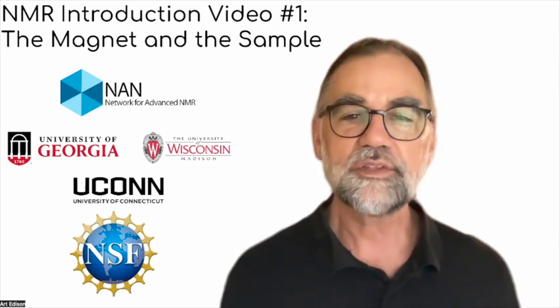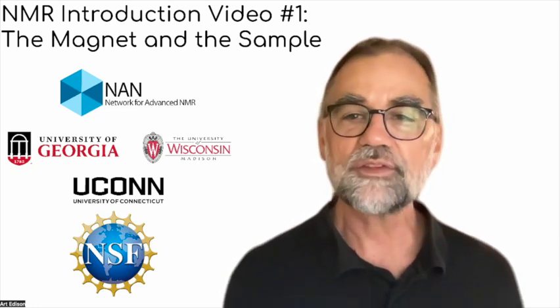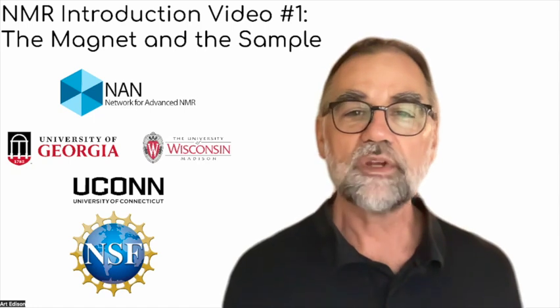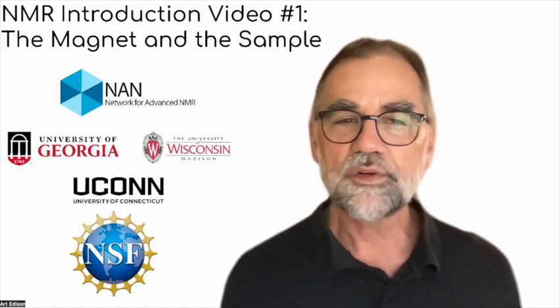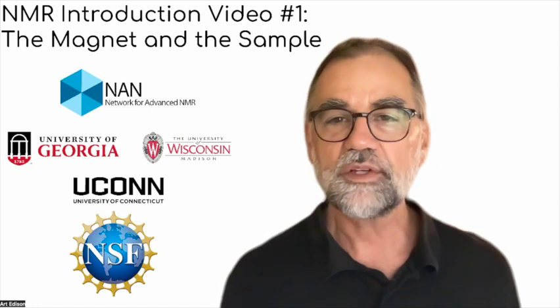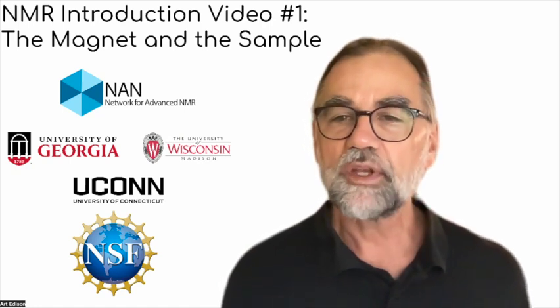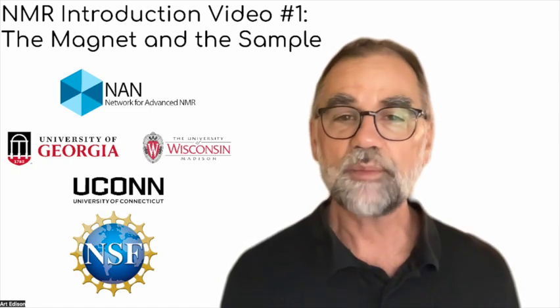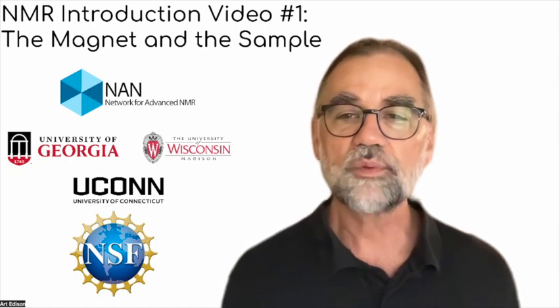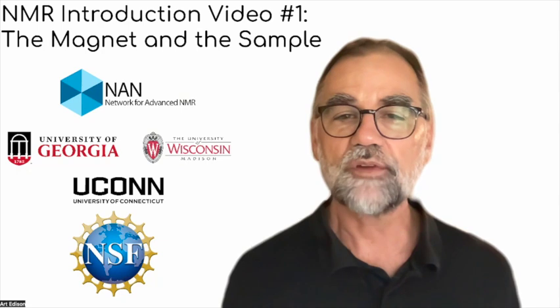This concept is at the heart of the Network for Advanced NMR, NAN, which is funded by the National Science Foundation. UGA is partnered with the University of Connecticut and the University of Wisconsin at Madison to develop an NMR instrumentation network as well as knowledge bases to help users find resources and apply them to solve their problems.